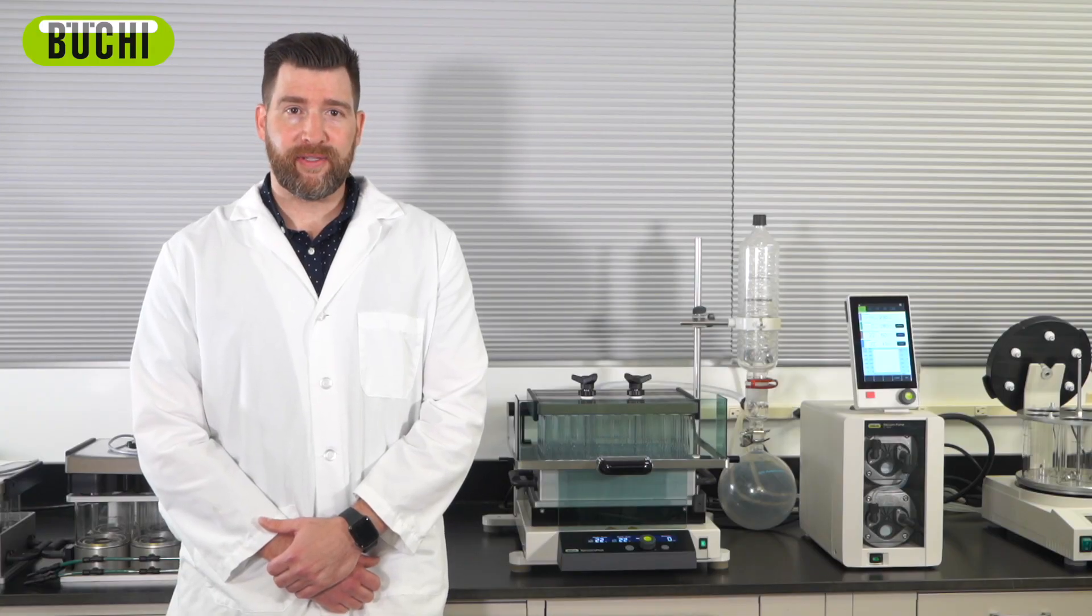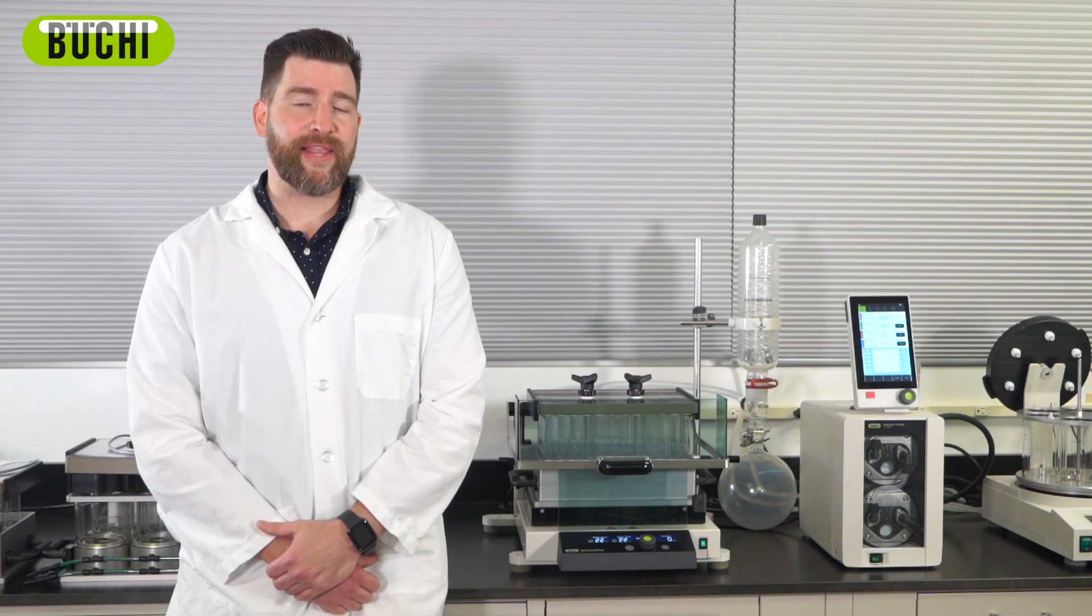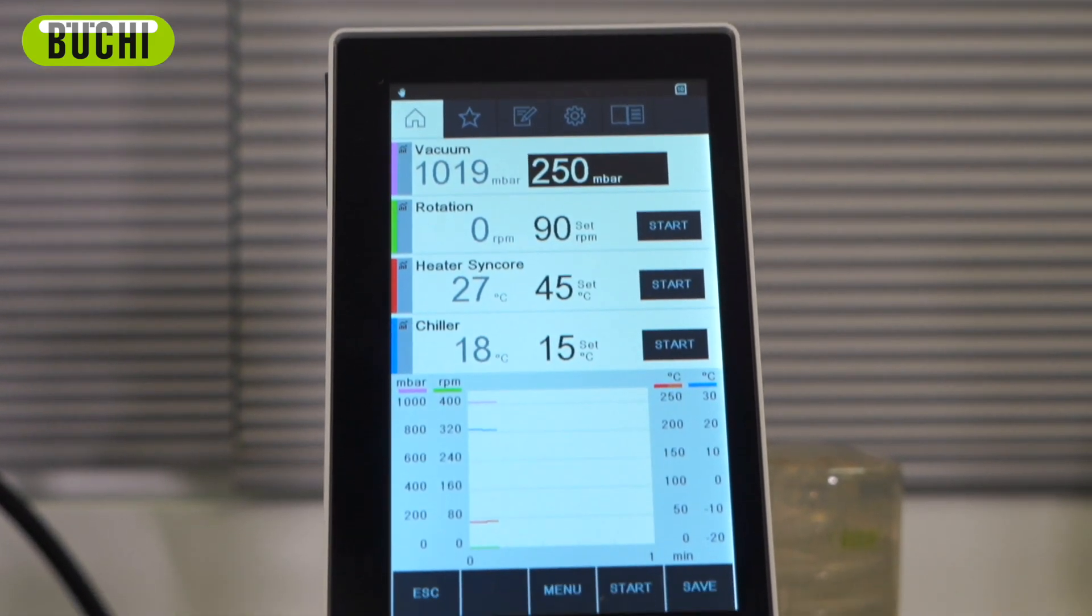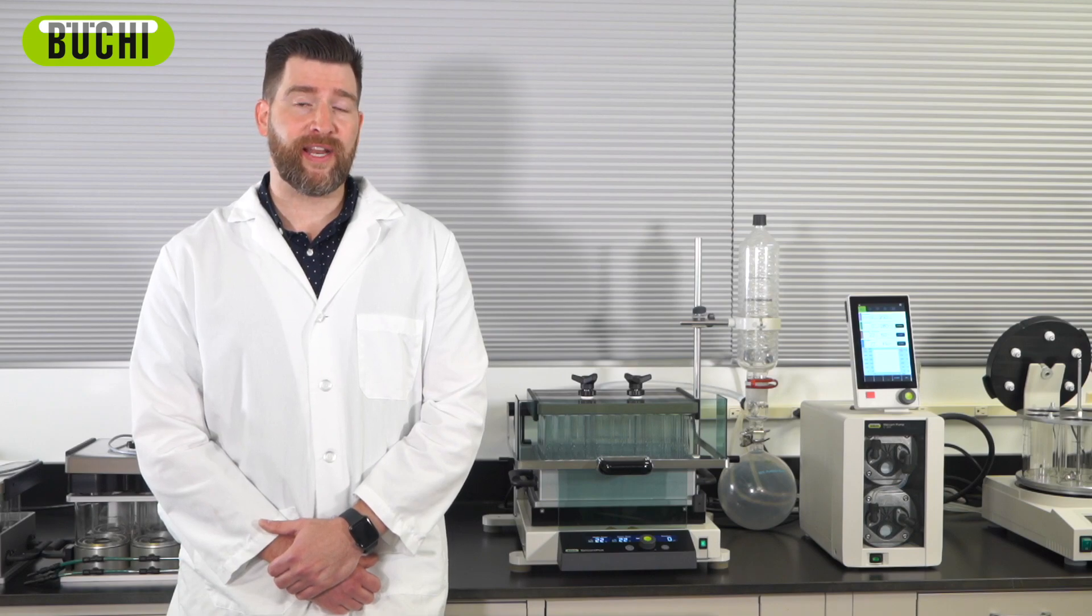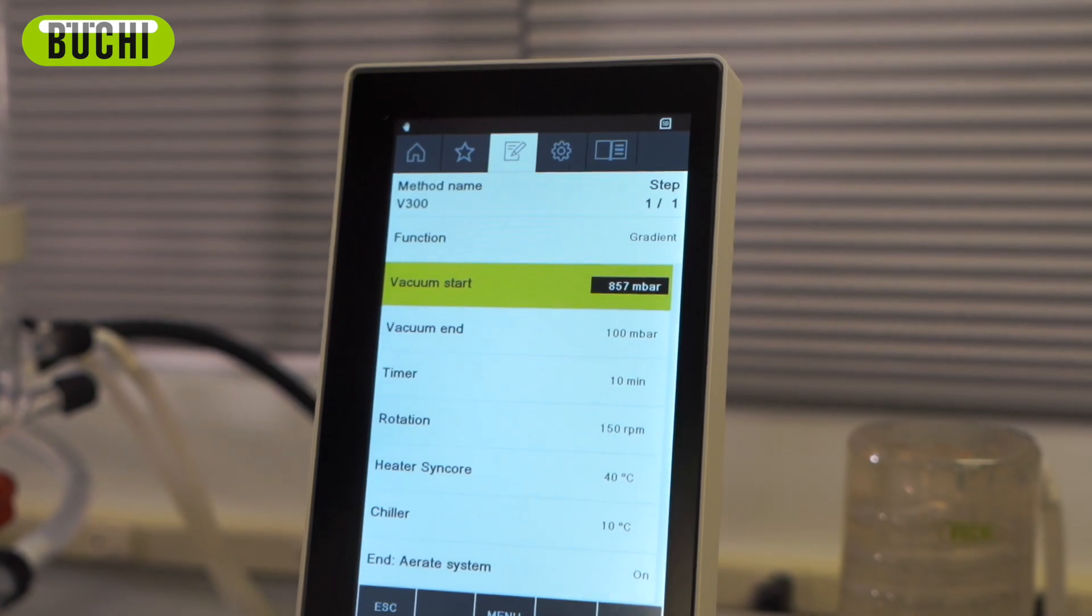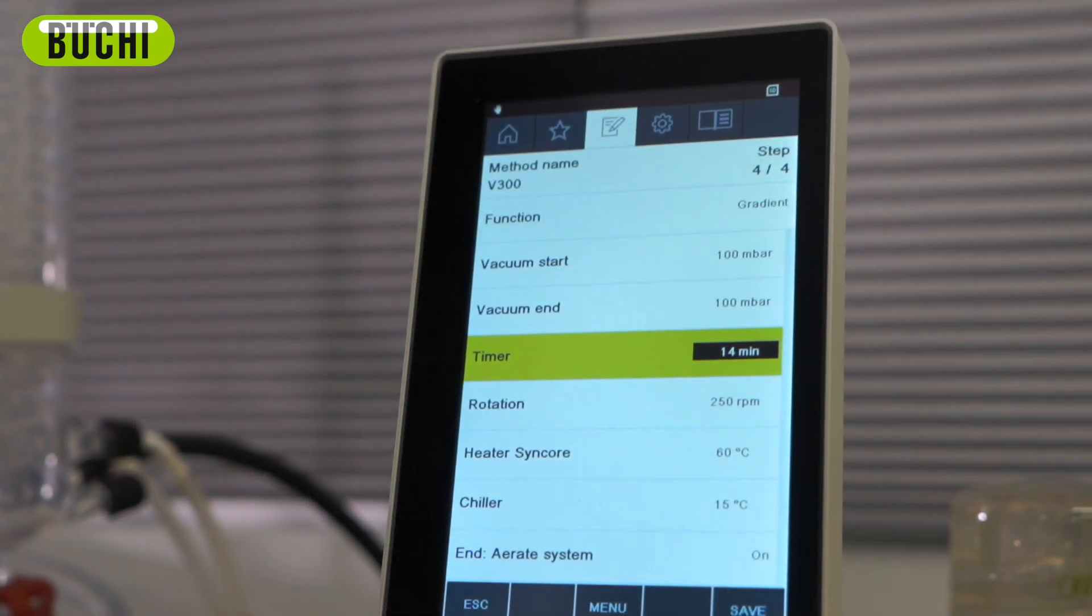Last but not least, your system can be completely integrated with full automation, using the i300 Pro interface. This interface connects numerous Buchi peripherals and accessories for centralized control, allowing you to optimize an automated step-by-step method. Its controls ensure that you have a true set-it-and-forget-it solution by directing the heating temperature, pressure, cooling temperature, step type, and step time.